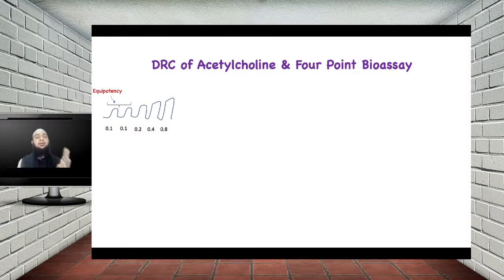So in case of standard and test, the minimum number of responses we are taking is 4. So we are taking 4 responses in case of the standard. Now we have done 0.1, 0.2, 0.4 and 0.8. So the 4 responses of the standard are done. This is called the DRC of the standard acetylcholine. So we have seen till the standard. It is called the DRC of the standard acetylcholine solution. We have taken here 4 doses of the standard: 0.1, 0.2, 0.4 and 0.8.